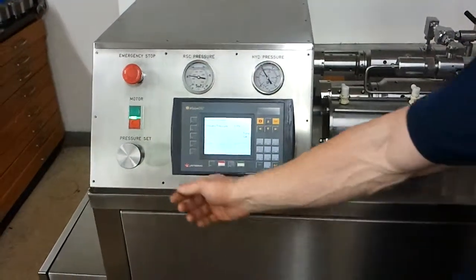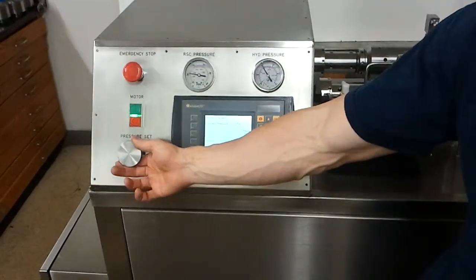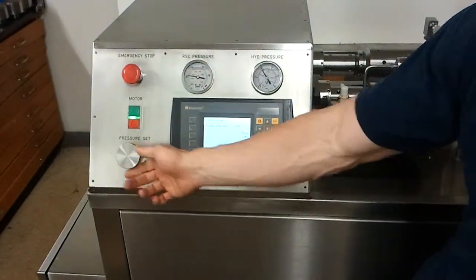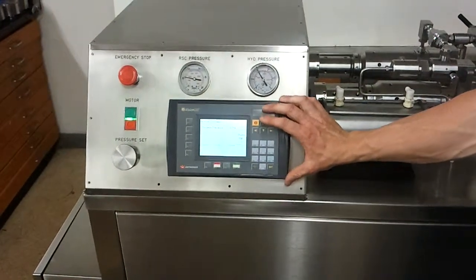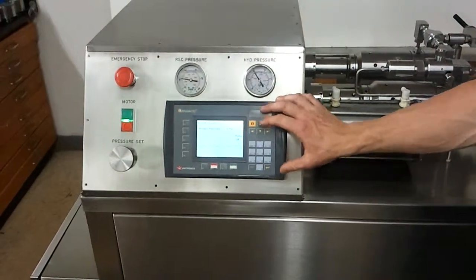You control the pressure right here and this unit is capable of 45,000 PSI.